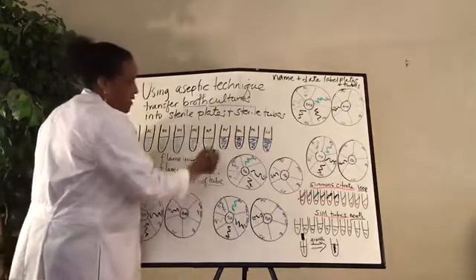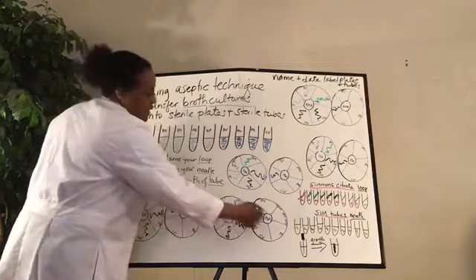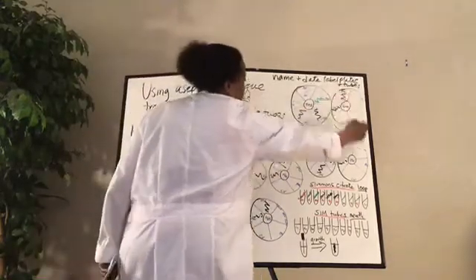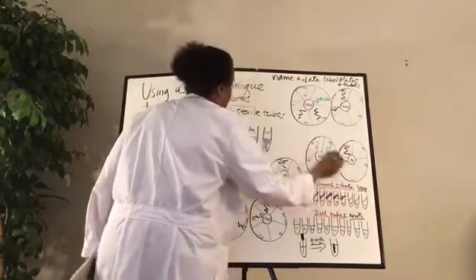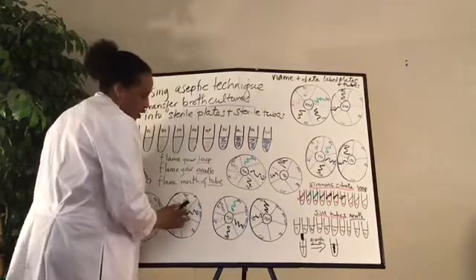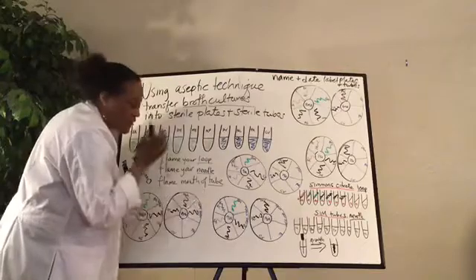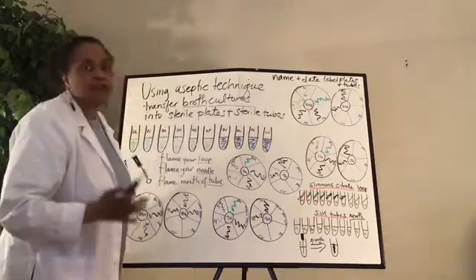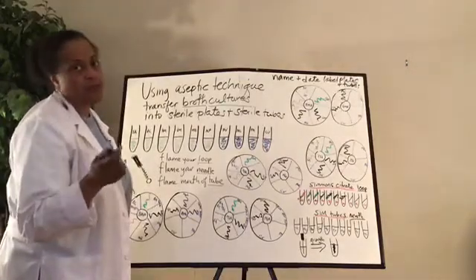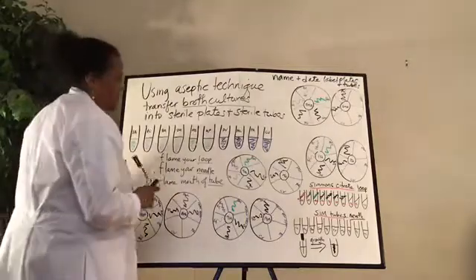So we're just going to finish up by getting Proteus vulgaris here, and here, and here, and here, and here, and then there. And Micrococcus luteus here, swiggle. Make sure you don't go past any of the lines. Do not go over into here. Just make sure, because you do not want this stuff to grow over into your other wells. So you know Serratia marcescens is notorious for going over into other wells.